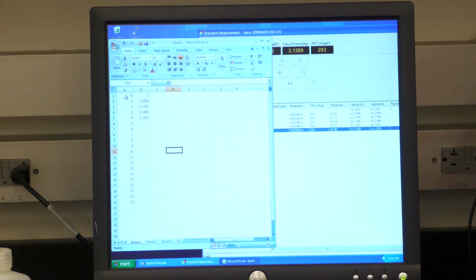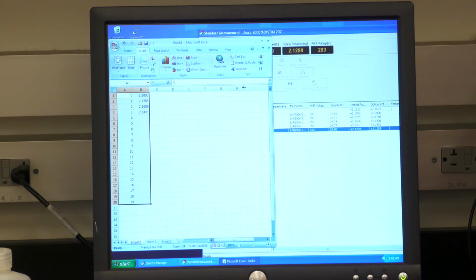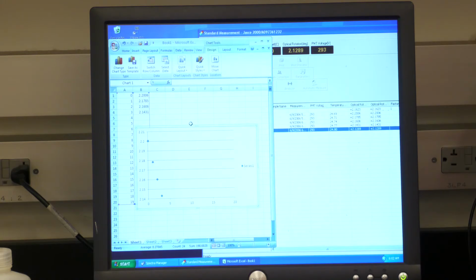So you can highlight this one. It needs to be moved a little bit upwards. So you can highlight a little bit extra because you want to see the overall change. Now you highlight this one, you come here to insert your graph, okay? You insert your scatter plot. So this is your data, okay? So you can see you keep decreasing, right? Keep adding this on.